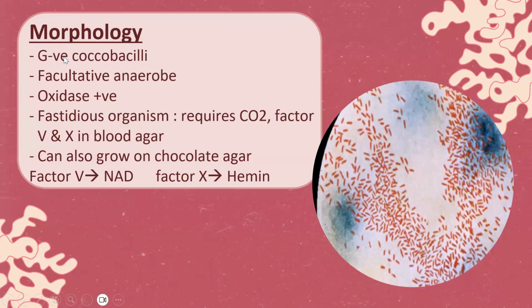The morphology is that it is gram-negative because it is pink, it didn't retain the gram stain, and it is a coccobacilli. It can be in rods, it can be in a cocci. It is a facultative anaerobe. It is oxidase positive, and it is fastidious, which is also important to note because of the satellism test.